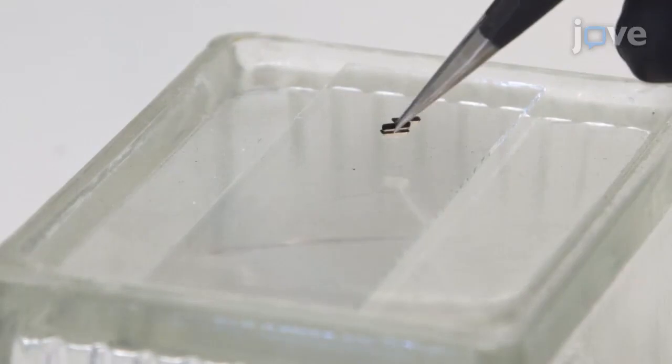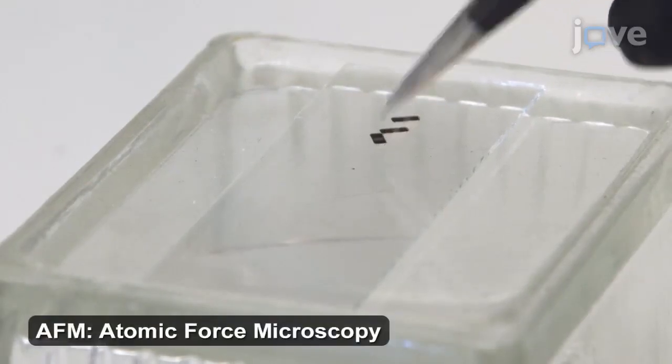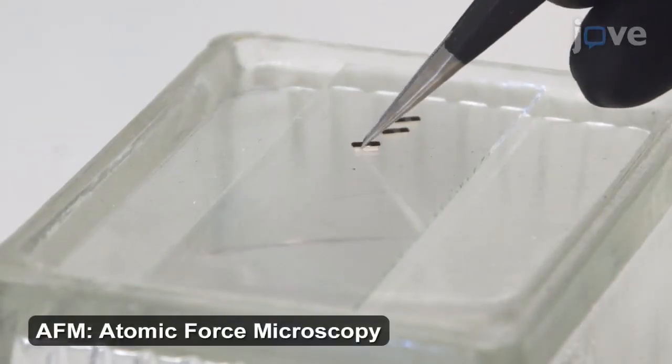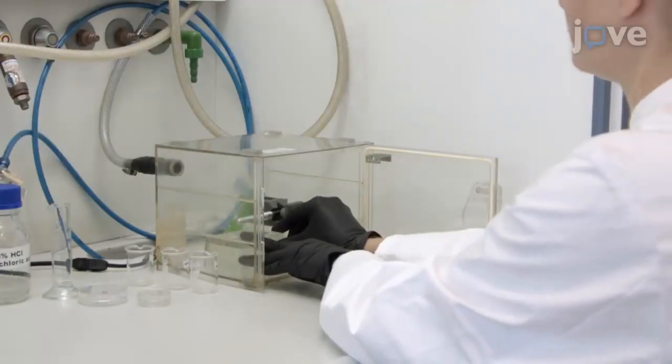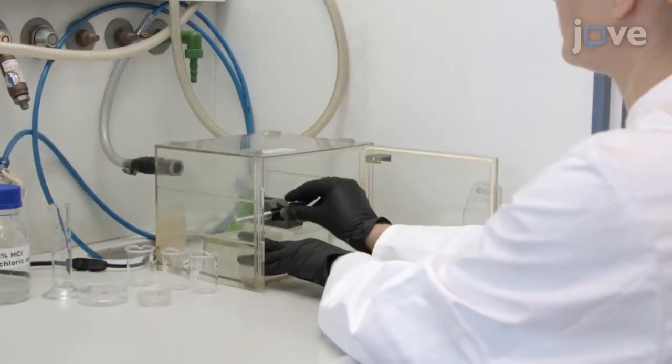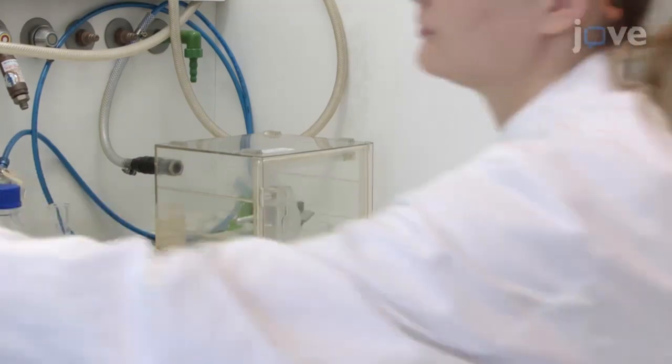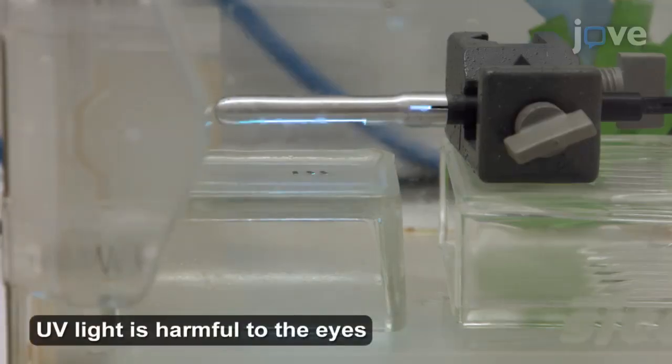Then, transfer the silicon nitride AFM cantilever probes to a clean glass slide with the tip facing upwards. Transfer the slide to a UV light impermeable chamber and irradiate the slide with ultraviolet light from above for at least 90 minutes.